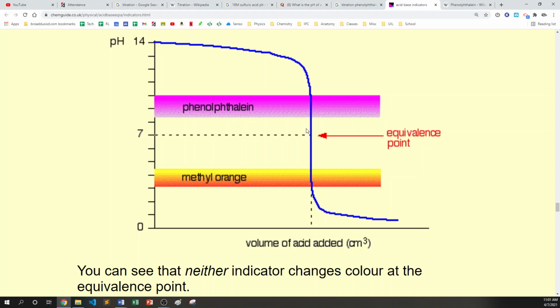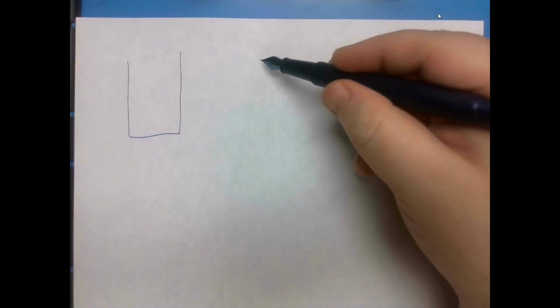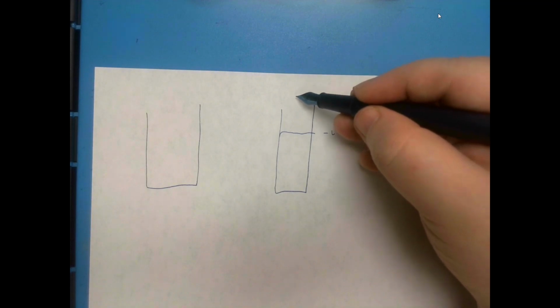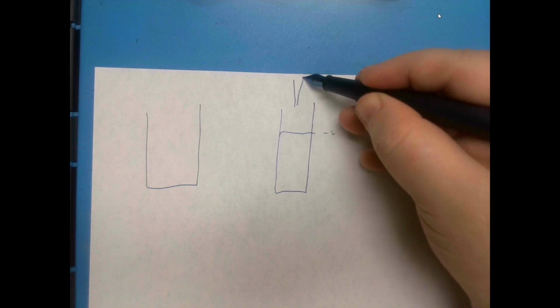So, during titration in the lab, the setup is usually that we put this indicator in it. It's called an indicator. We use a tube so we can measure the initial volume. And then we use a titration setup. It's basically a little funnel where we can look at volume, and we have this on-off switch right here.